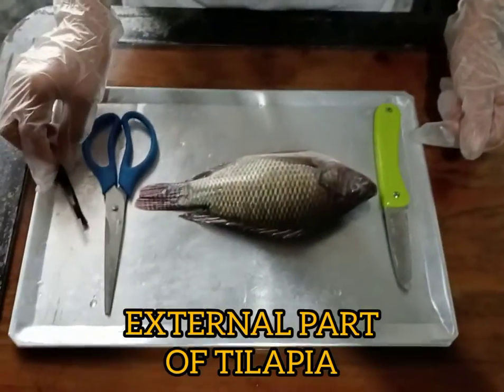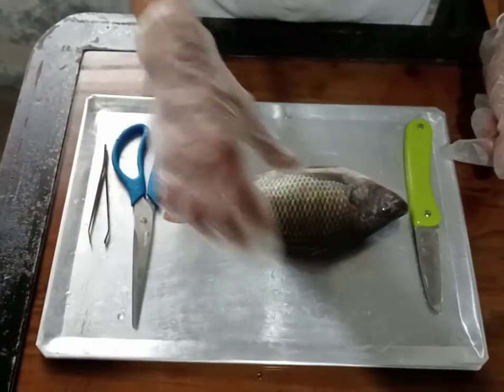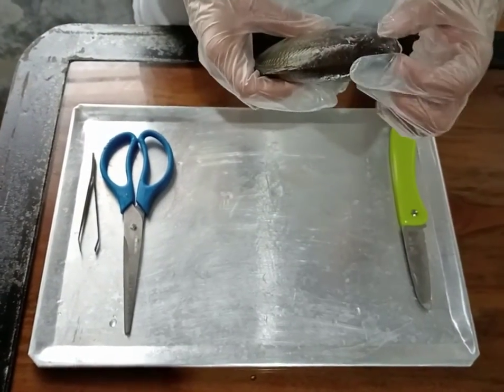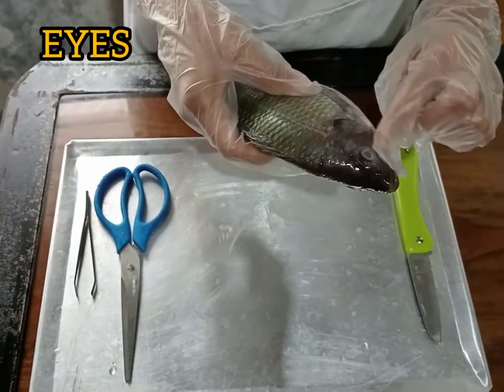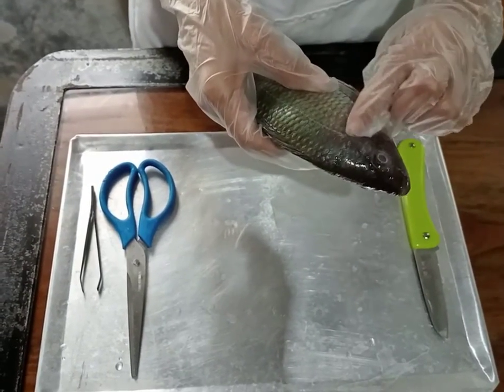This is the external part of the tilapia. We have here the mouth, and the eyes, and the brain.